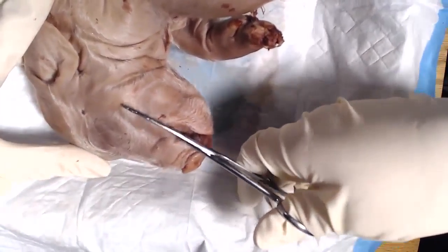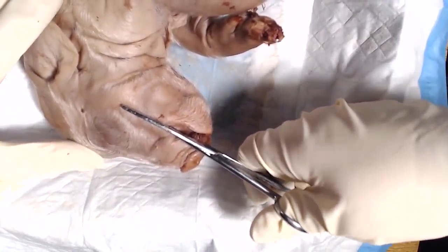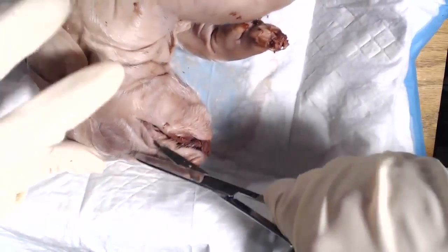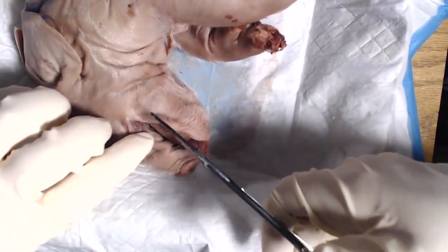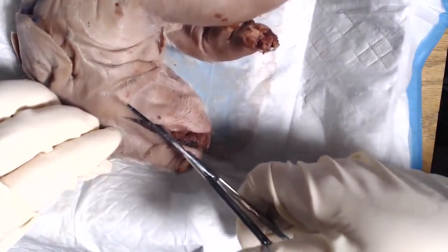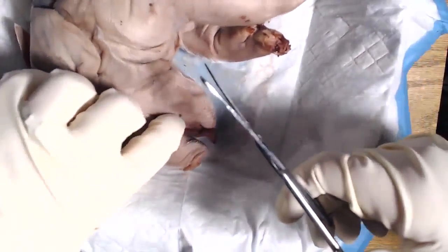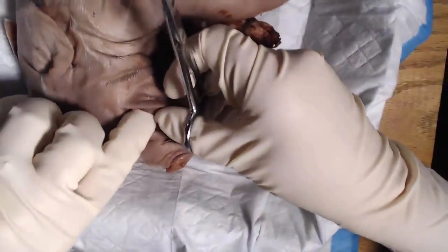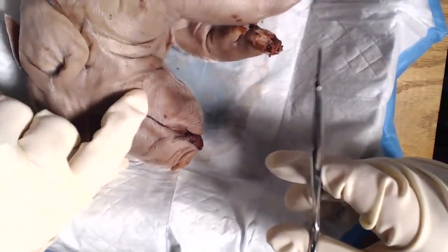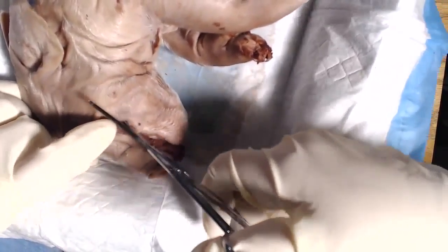And you can see how I'm aiming towards the ear again. And make that cut. This one's just kind of through the cheek, nothing hard yet. I'm going to feel for the bone a little bit to make sure I'm cutting in the right direction, and the masseter as well. I'm going to feel for the masseter.